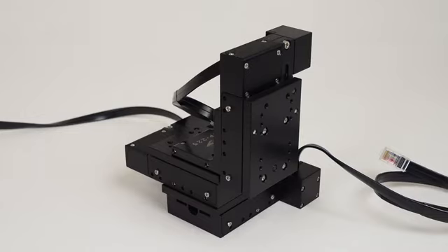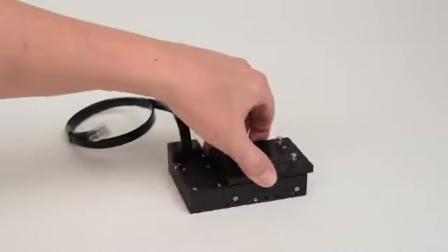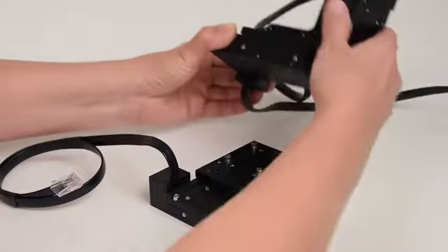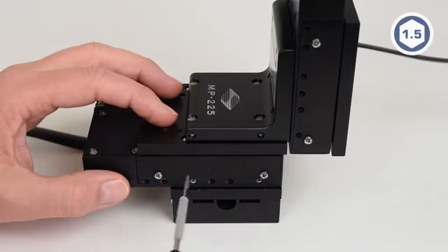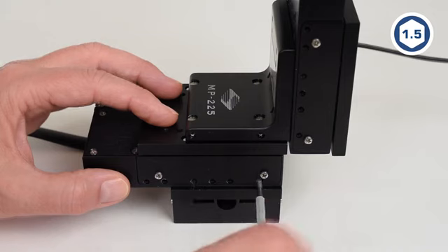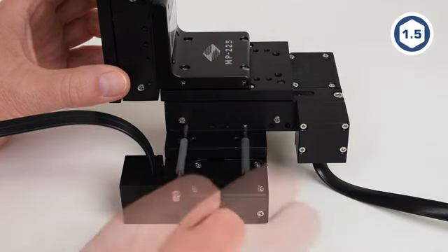Pull the Y and Z axes of the manipulator straight up to remove it from the X-axis. Flip the X-axis 180 degrees. Reattach the Y and Z axes to the x-axis. Tighten the screws on one side of the y-axis. Now, tighten the remaining screws on the other side of the y-axis.